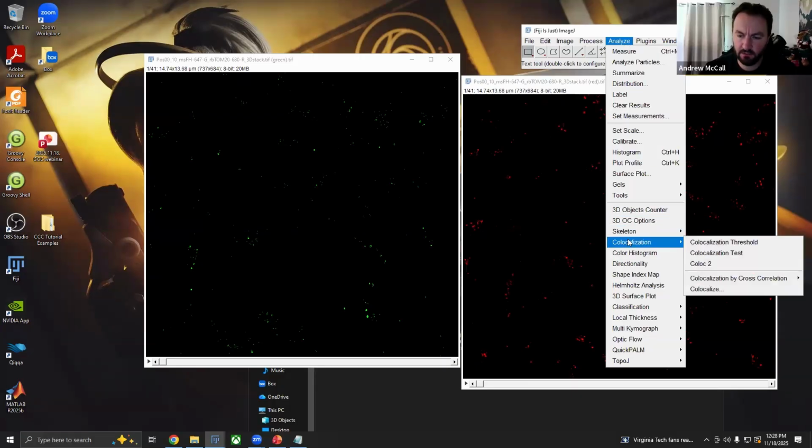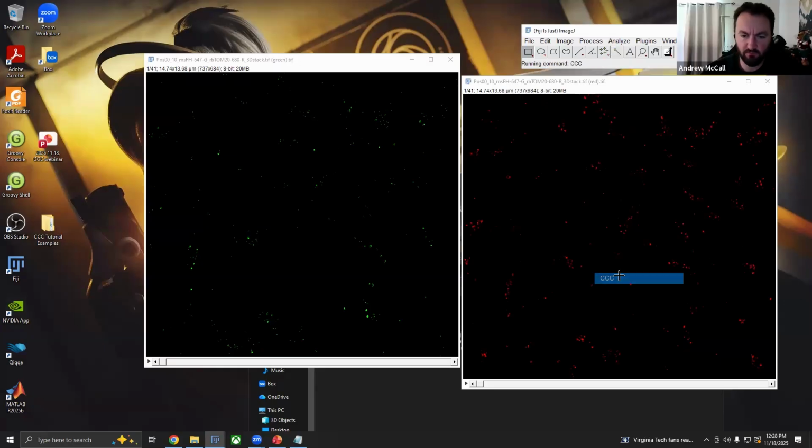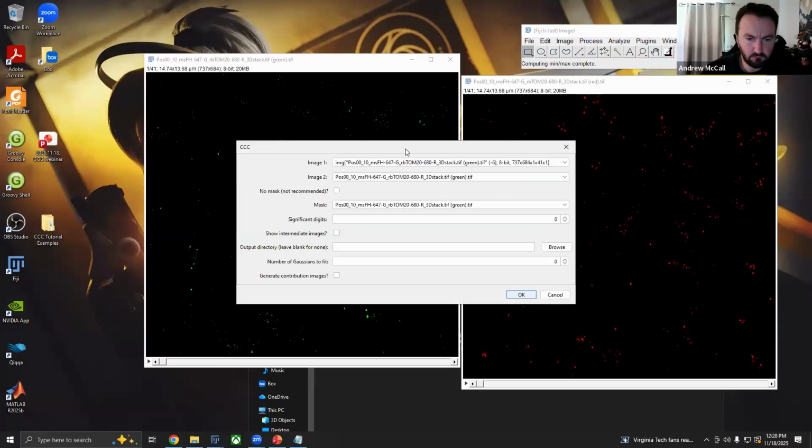Once you have it, if you go to analyze colocalization, you will find it in here, and we're going to use CCC. There are a couple other options. If people want at the end, I can talk more about those. This is kind of the main one that you'll be using here.